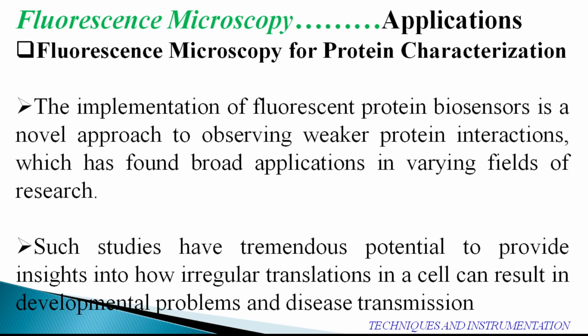As you can see on the screen, in the very recent article, that means in the last 2 decades, such experiments were carried out in this new area of research and application. Many studies have shown that human teeth show autofluorescence.